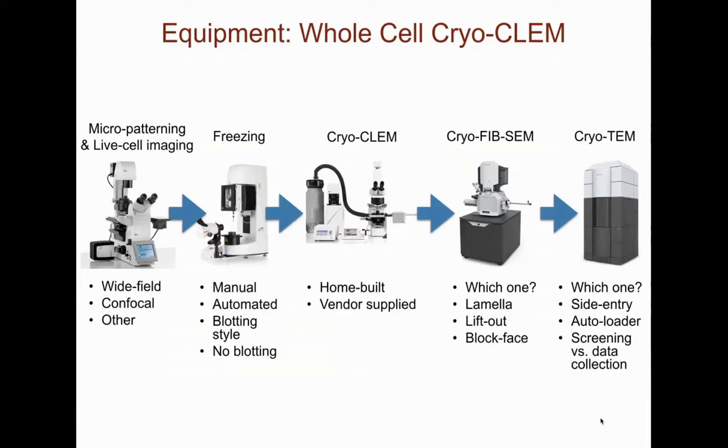We are all investigating exciting biological questions that may benefit from light and electron microscopy imaging. However, we may not know what resources we need for addressing these questions and whether we should house them in our own laboratories or use them as part of a shared resource.